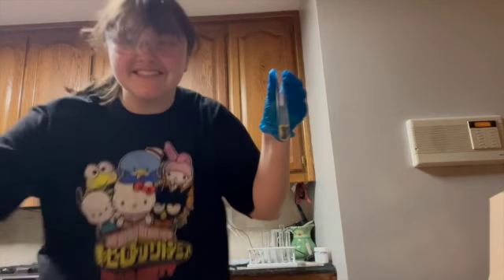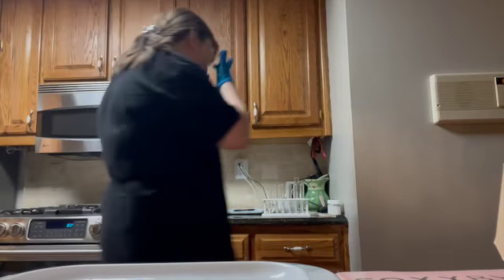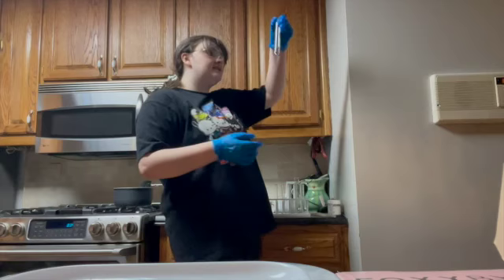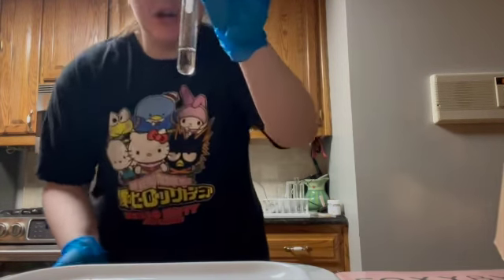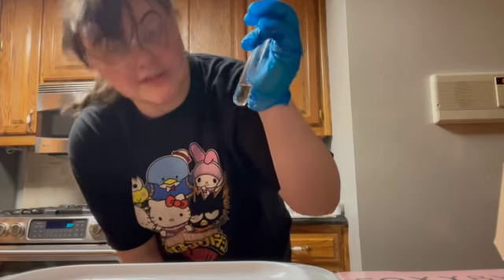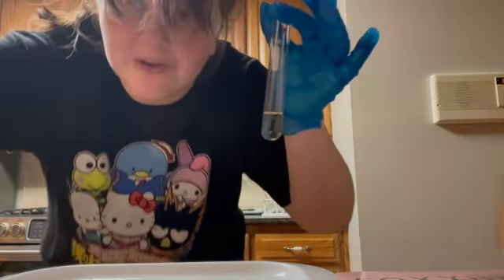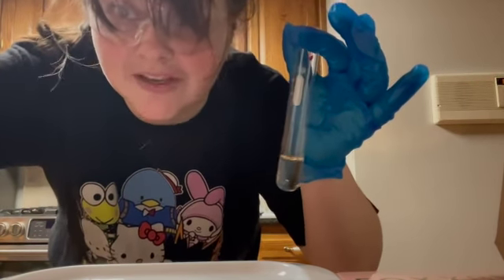So we're at the 26-minute mark, and our solution has become very clear. At the 22nd minute mark it was this champagne color, but it's getting so close, but it's not close enough. If you compare it to water, it's still not as clear. So I will give it a little bit, it might need just a minute or more until it's completely clear.